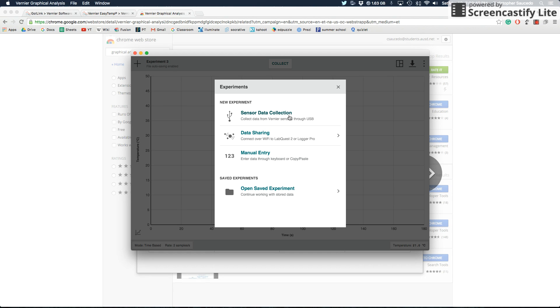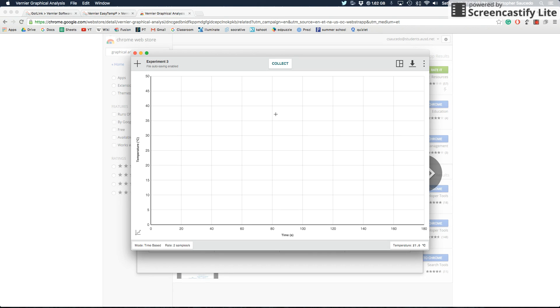If we read what these all say, it says sensor data collection, collect data from a Vernier sensor through the USB, which is what we want. So when you click on that, it'll give you this big screen. Here's what you're going to want to do and what you're going to want to be able to manipulate whenever you're doing an experiment. The first thing is you want to name it.